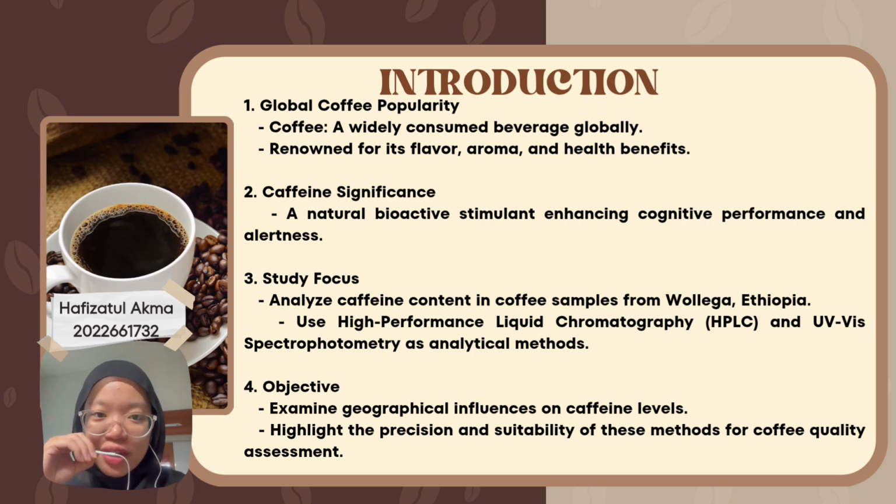By comparing the results from these techniques, this research highlights the influence of geographical origin on caffeine level and emphasizes the precision and applicability of these methods in assessing coffee quality.